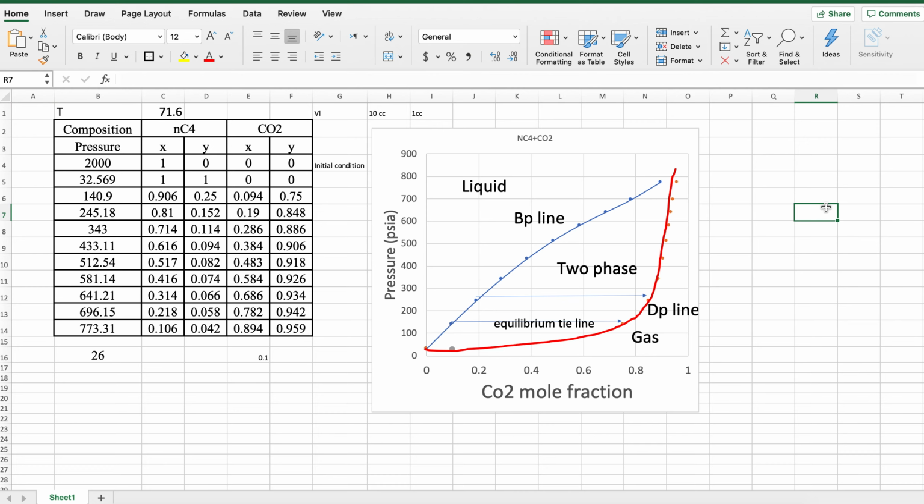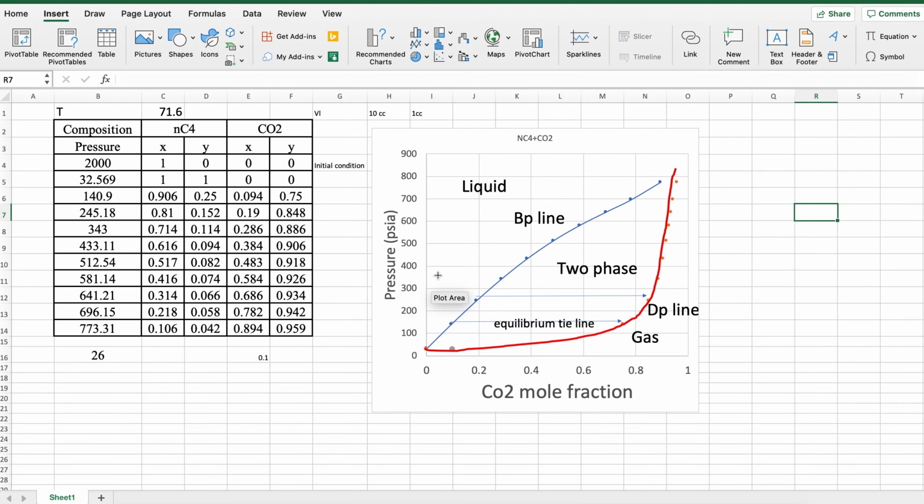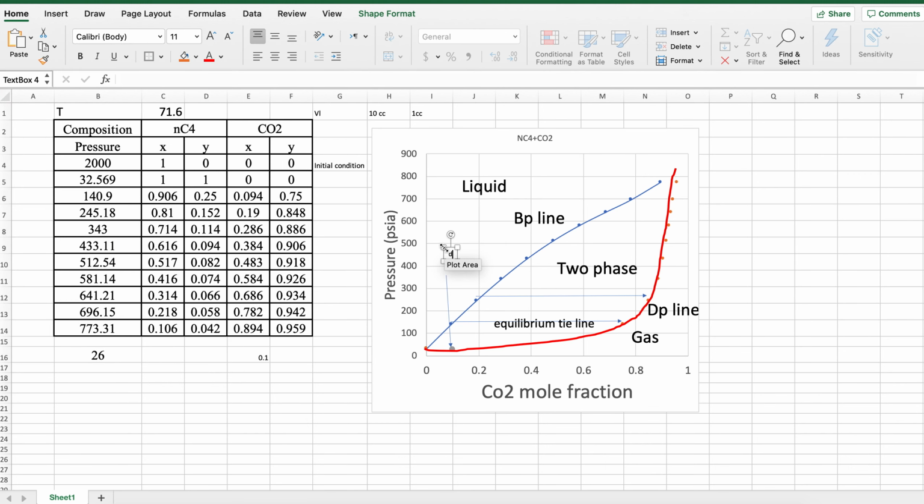one of those volumes of the CO2 that needs to be added to your report. And you can also mention that this is the point that you used for the dew point check.